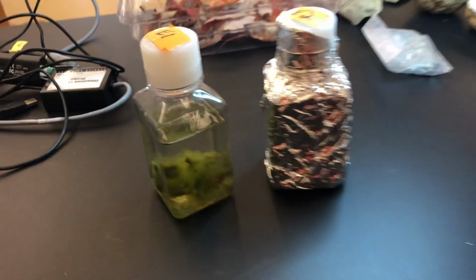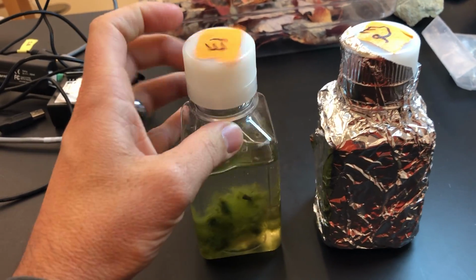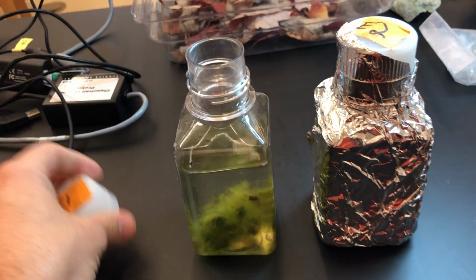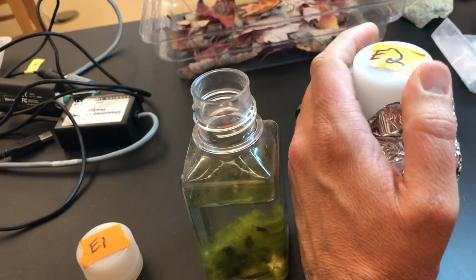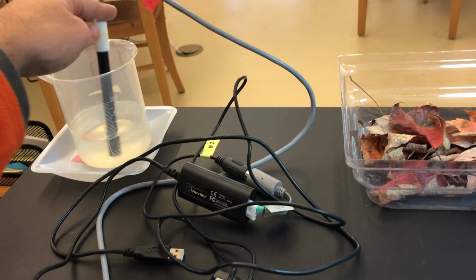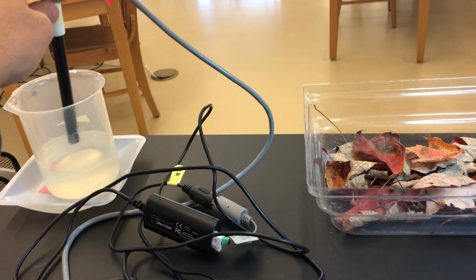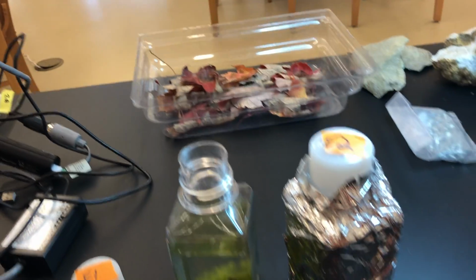We got the data, the first round in milligrams per liter, and I'm going to do a quick conversion to turn that into parts per million. But now what I'm going to do is take my second reading, using the dissolved oxygen Vernier probe right here. It's been sitting in this wet solution so that it remains calibrated the whole time between when I took my initial reading and my second reading.